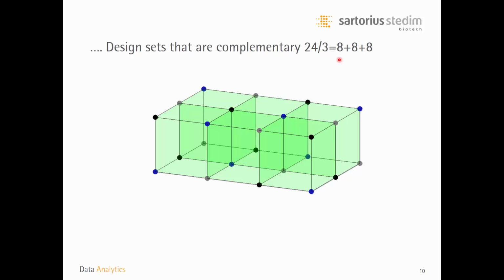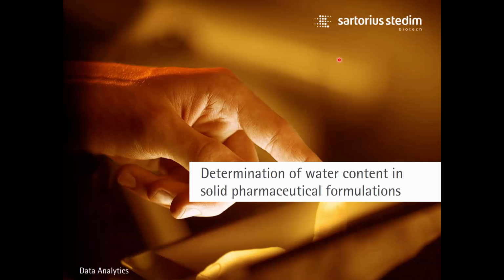And we will discuss more about these possibilities during the discussion of the application and also during the demonstration in the MODDE software. So we will now go into the second stage of this presentation that deals with this application of determining water content in tablets.